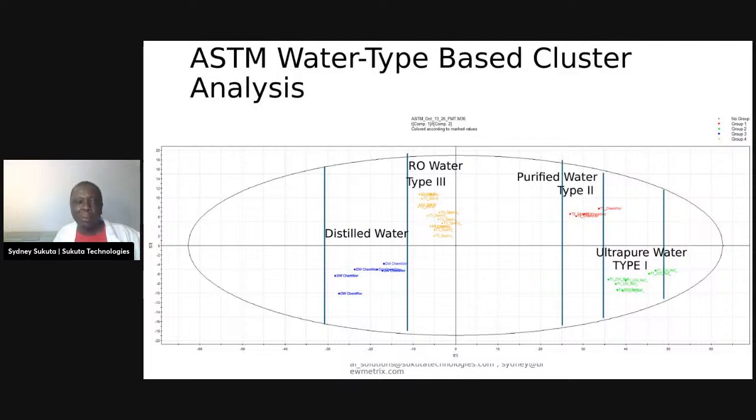So anyway, let's get the water straightened out. Is this the water we want? And then we can start to brew. In addition to checking that this is the water we want, we can also do compositional analysis. What's really in that water? Your zinc, sulfates, and all that. But this will be the first line of screening before you get details.